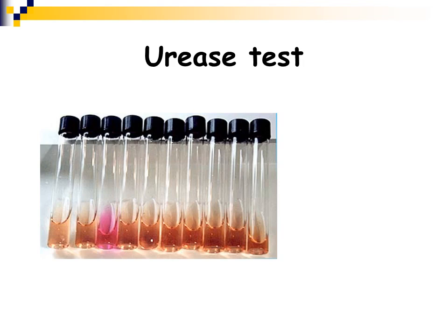The far left is uninoculated. All the other tubes except for the third tube in are negative. That third tube in, that bright pink colored tube, is positive. Now urease can be a test, or urea media can be a broth test. It can be a slant agar test. It comes in several different forms. But again, you won't do this test manually in the laboratory, but the instrumentation does do a urea test.